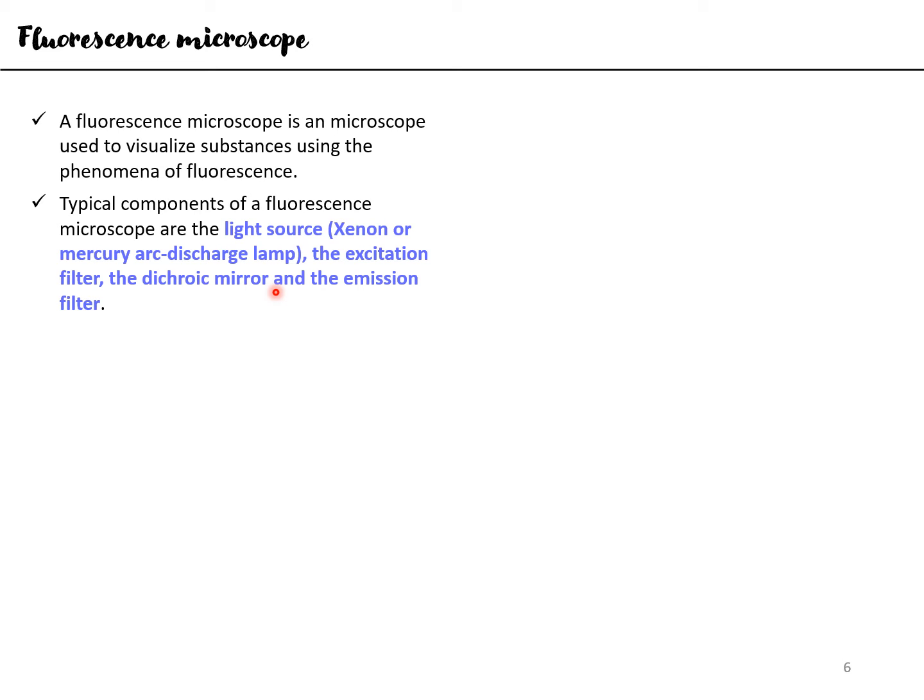So let us now discuss what each of these components mean and what is their utility. Why are these components required and what function do each of them serve?